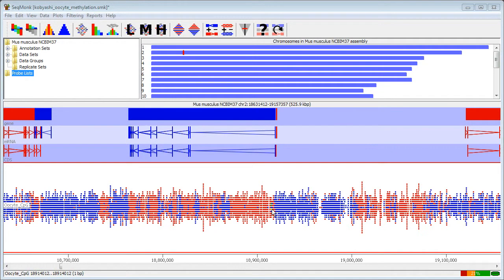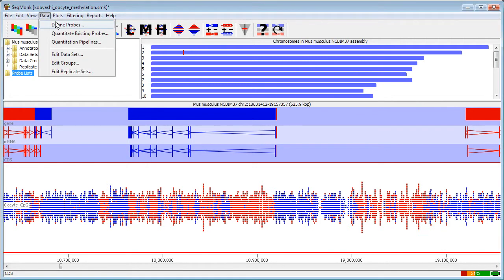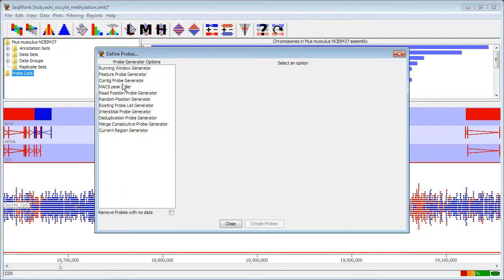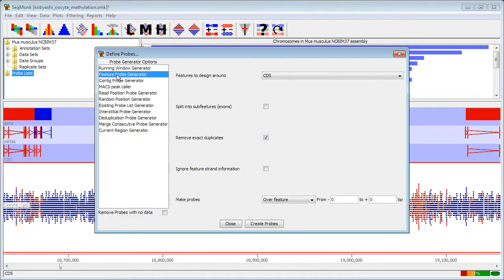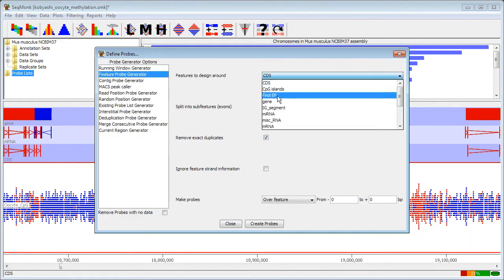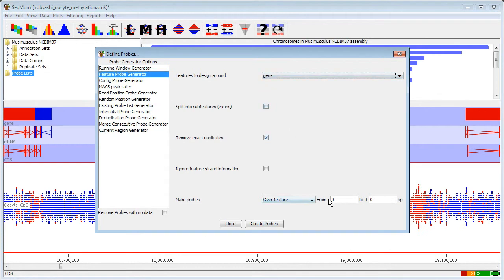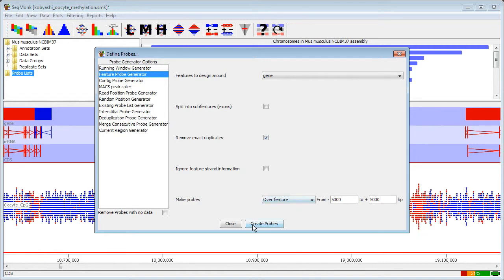To start with I'm just going to make single probes over all of the genes that I want to measure with five kilobases of context on either side. So I'm going to define my probes with the feature probe generator around genes and making five kilobases of context on either side.